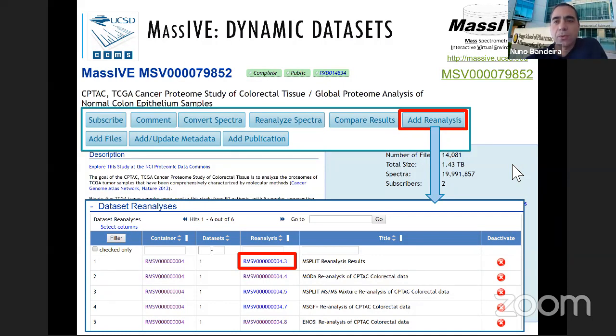You get a password and reviewer access credentials, and only people with the credentials can access the data set. Until you decide to make it public, which is something that you have to do very explicitly. You have to come to the repository and click a button that says make public, and only then does it get public. So I hope that answered the question. There's no predetermined limit, and it does not have to be public to begin with.